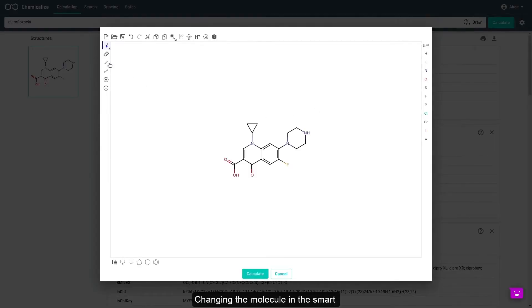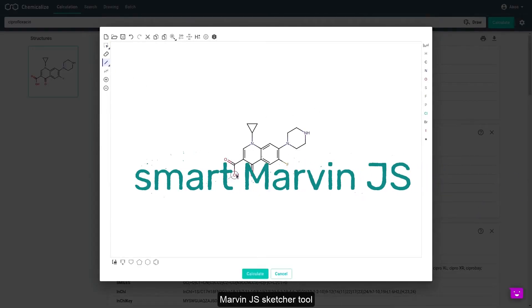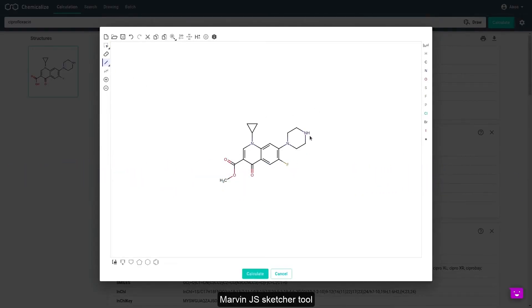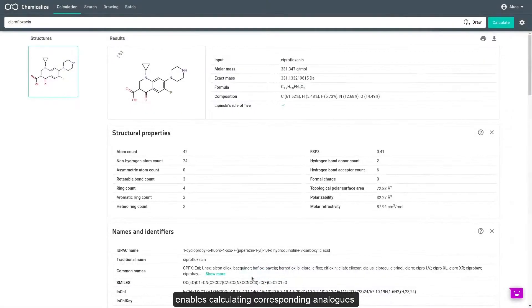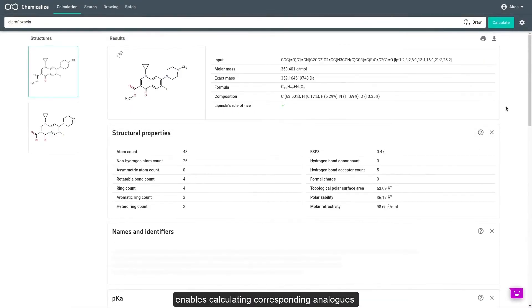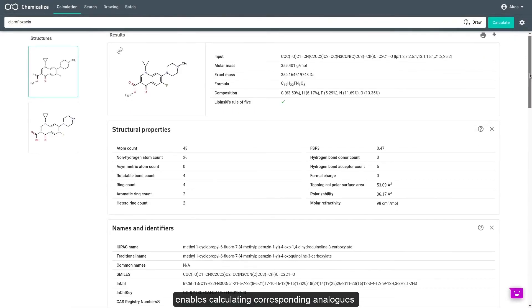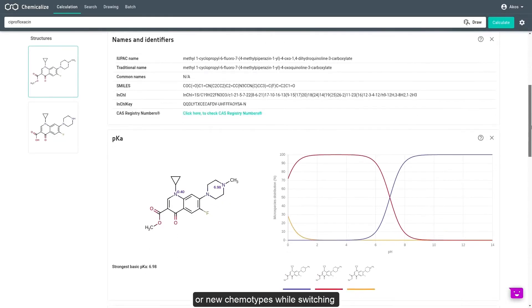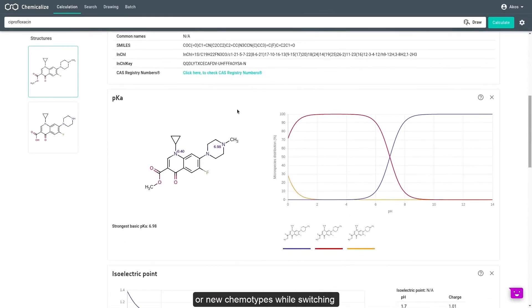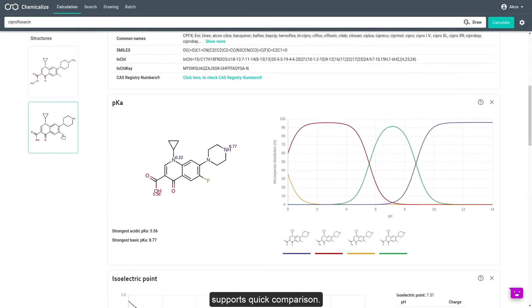Changing the molecule in the smart MarvinJSSketcher tool enables the calculation of corresponding analogs or new chemotypes, while switching supports quick comparison.